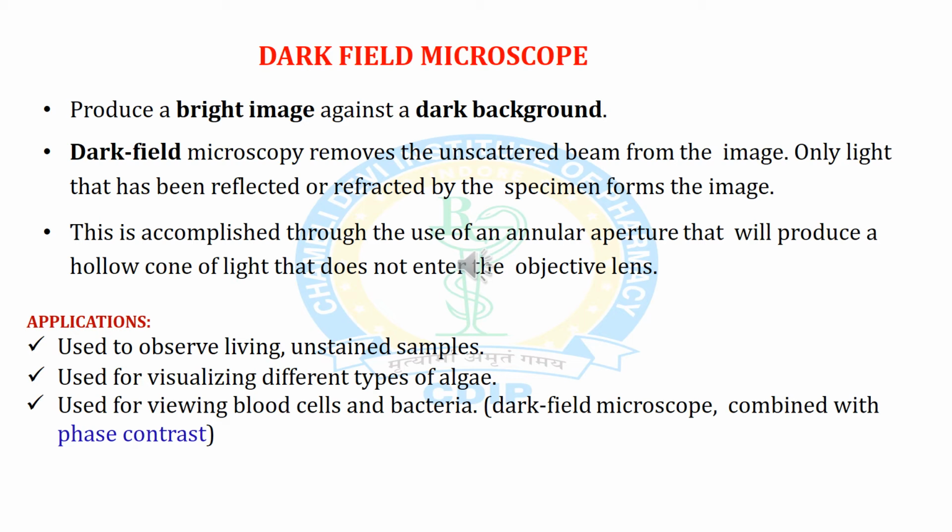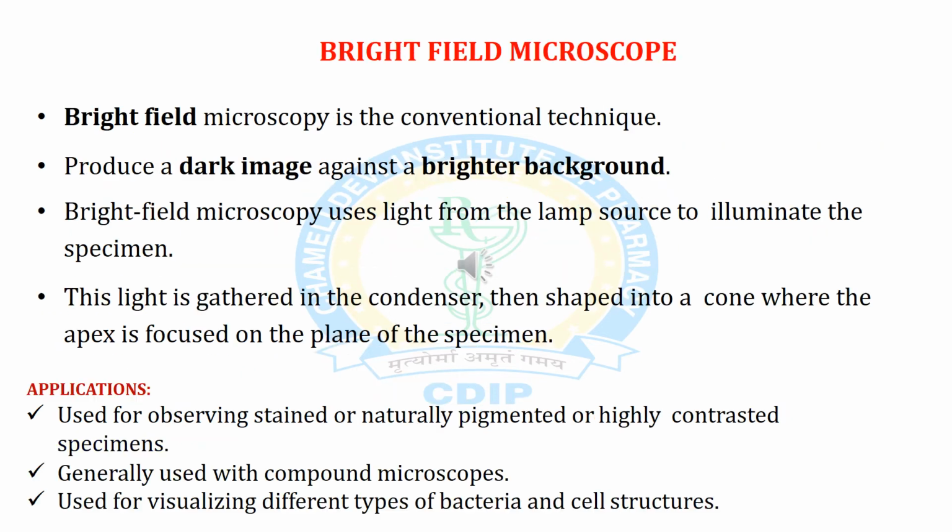We will discuss the application of dark field microscope. It is used to observe living unstained cells, used for visualizing different types of algae, used for viewing blood cells and bacteria. So this is dark field microscope.